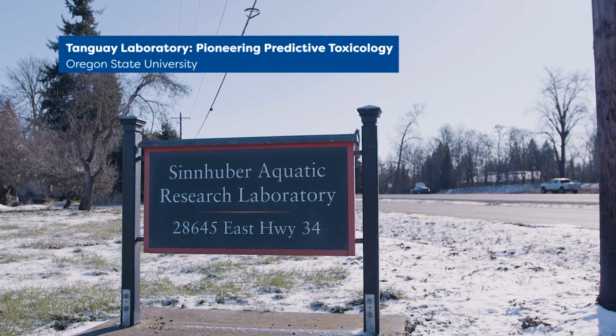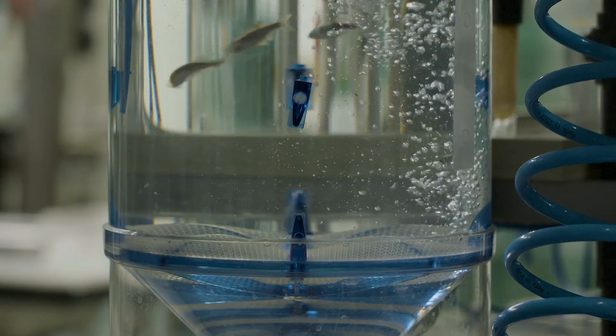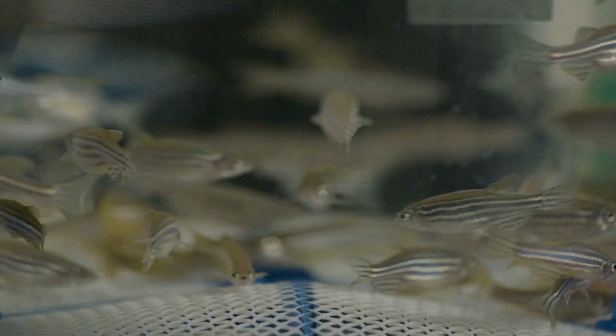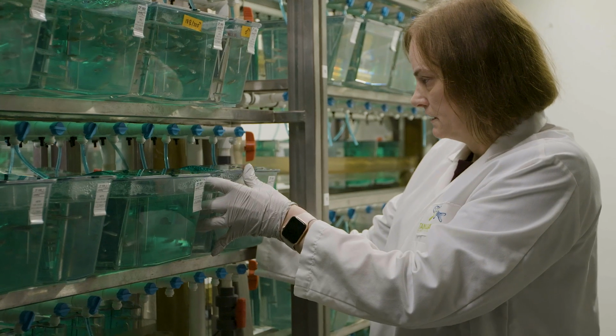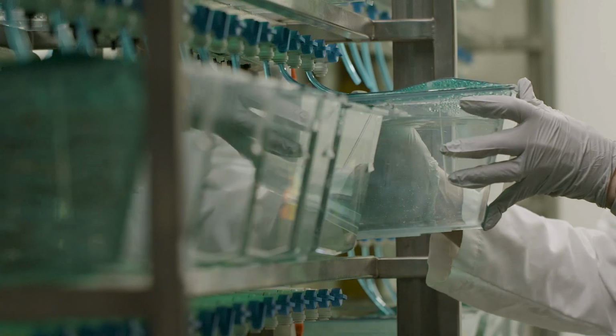The Tanguay Laboratory is interested in identifying the chemicals in the environment that might perturb human or environmental health. We use the zebrafish for all of our research questions, and there are a lot of reasons why the zebrafish is an ideal model. First of all, it's a vertebrate like humans, so they share a lot of similar genes, and gene functions are conserved across species.